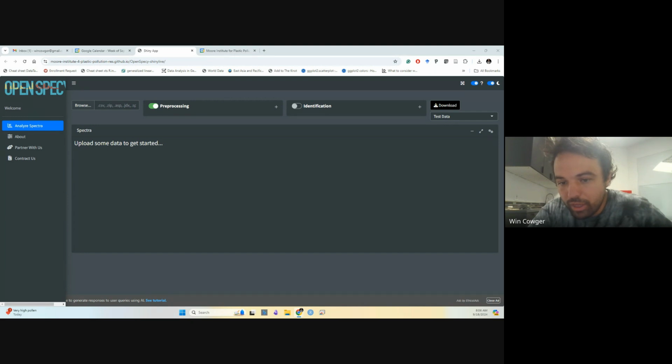UK and Chrome. Hazel, I know there were some issues with Chrome that we had to overcome for data upload. So I wonder, I'm using Chrome too. So let me try to run this.